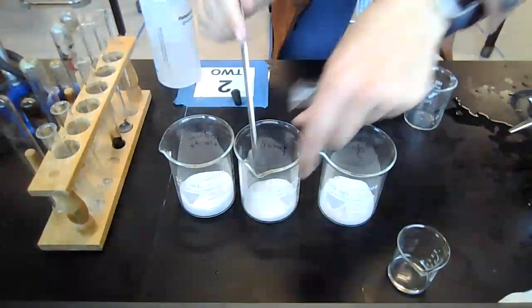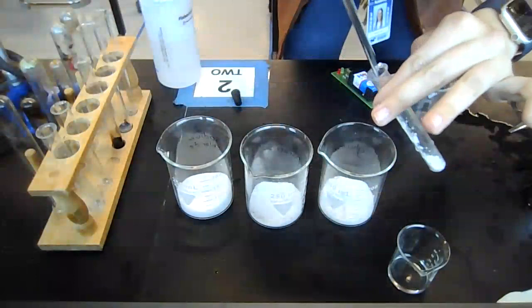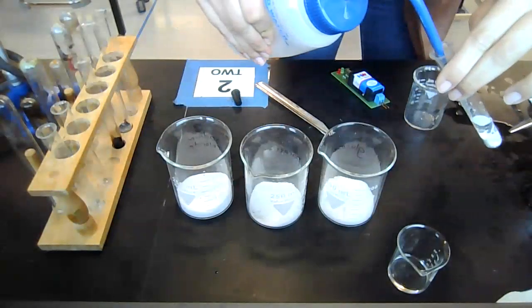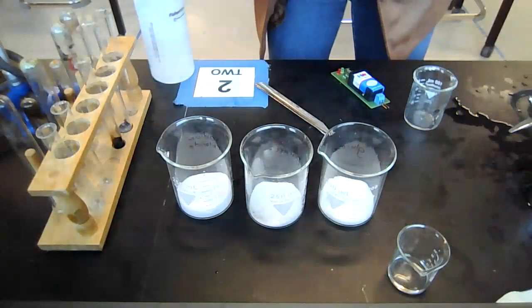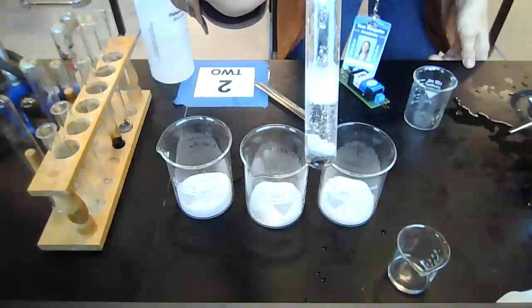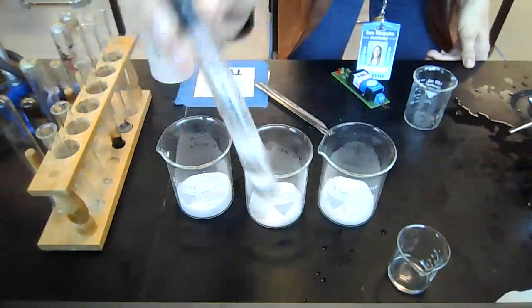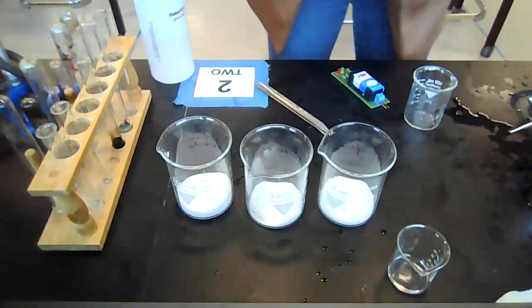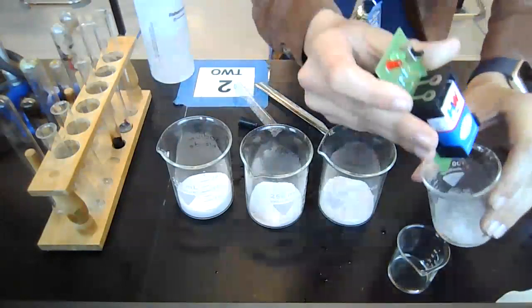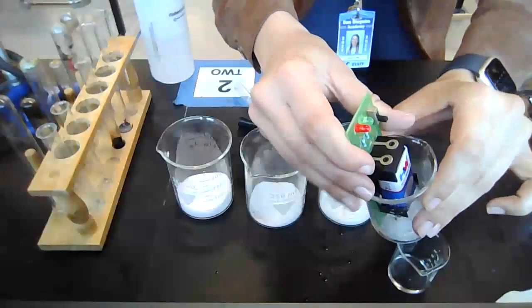What we have is paraffin, which is wax. So get a nice scoop of this, add this into my test tube, add my deionized water. You can already start to tell that nothing's going to happen. You can see that solid is just sitting at the bottom of the test tube, and it's not dispersing throughout. So wax is definitely not soluble in water. And you can test that conductivity as well. Light does not turn on, not conductive in water either.